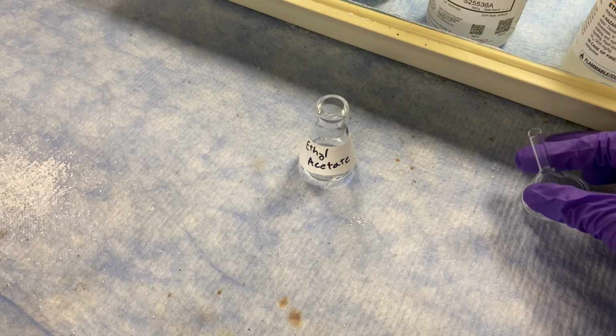because all liquids are always evaporating, and that's especially true of organic liquids. They evaporate really, really easily, but all liquids are always evaporating, and so if you just carried this through the room, there would be vapors of ethyl acetate in the room that you would eventually breathe in.